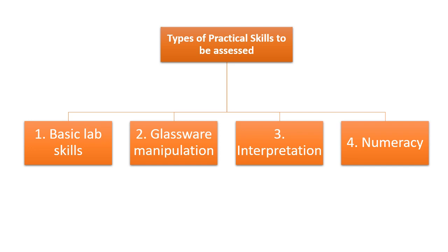In this lecture, we will move on the 4 important sections that you will need to focus on while preparing yourself before the SChemEs exam. First, we will start with the basic skills, and then we move on the glassware manipulation and how to use the most important glassware that you have in the lab. Third, the interpretation part, and fourth, the numeracy part.